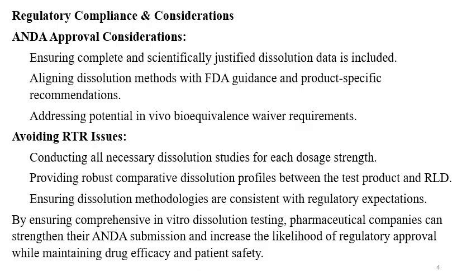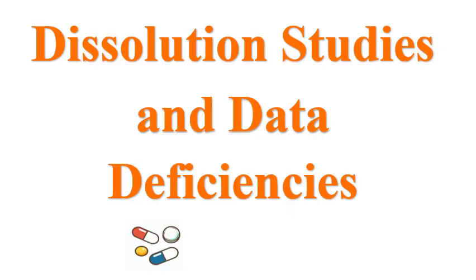So, by ensuring comprehensive in vitro dissolution testing, pharmaceutical companies can improve the ANDA quality, strengthen the ANDA submission, and avoid the RTR. As dissolution studies are related to the safety and efficacy of the formulation, the regulatory authorities are very stringent about the dissolution requirements.